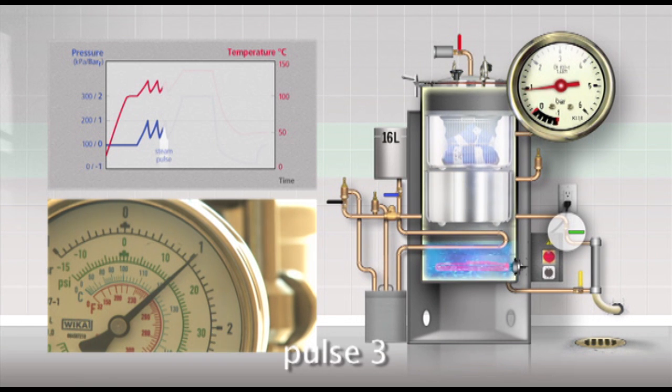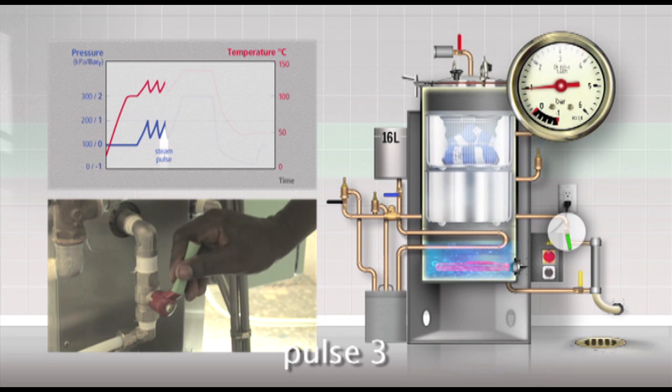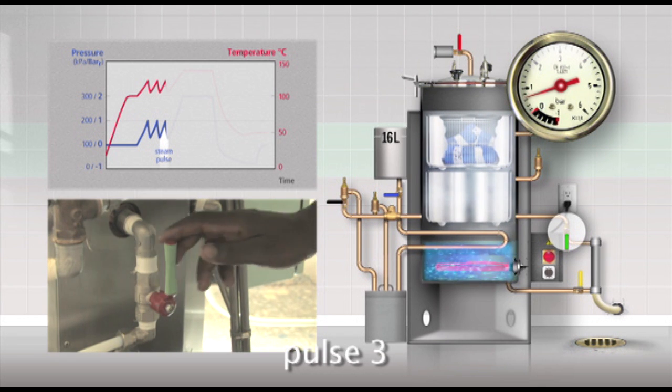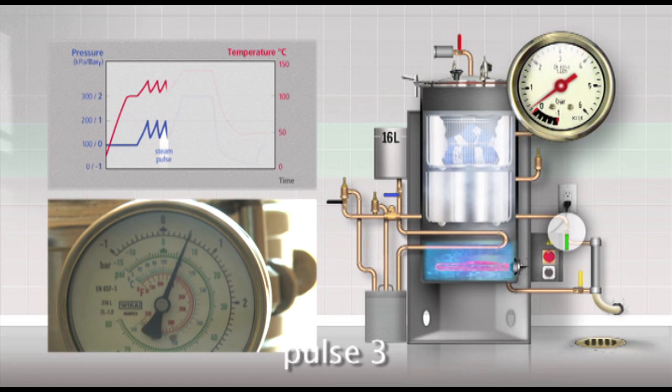Allow the pressure to build up a third time to 1 bar. Then again open the green valve. Let the pressure drop to 0.2 bar and close the valve again.